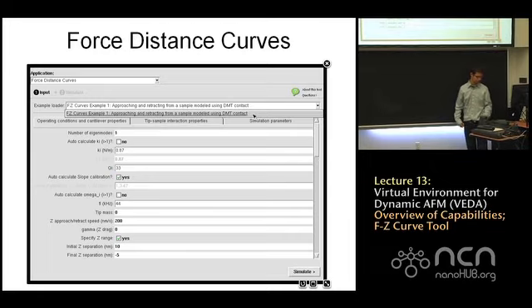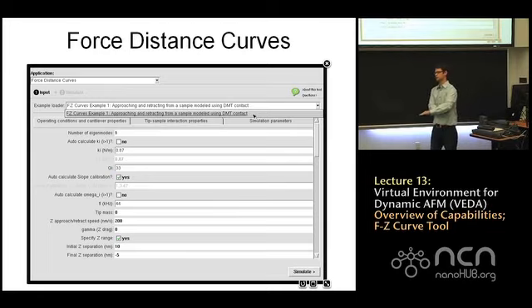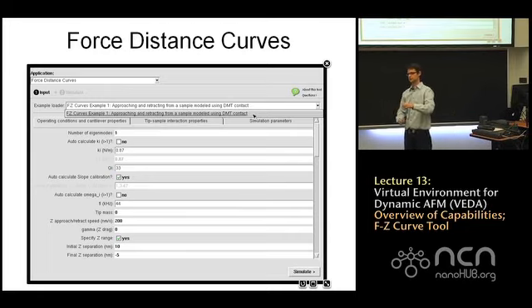We loaded all these inputs, and they're on this page. Also, there are parameters like the speed with which we approach the sample, and the initial and final Z displacements. This is not the same thing as a tip-sample gap. We're now specifying how the piezo actuates the cantilever in terms of the Z displacement.